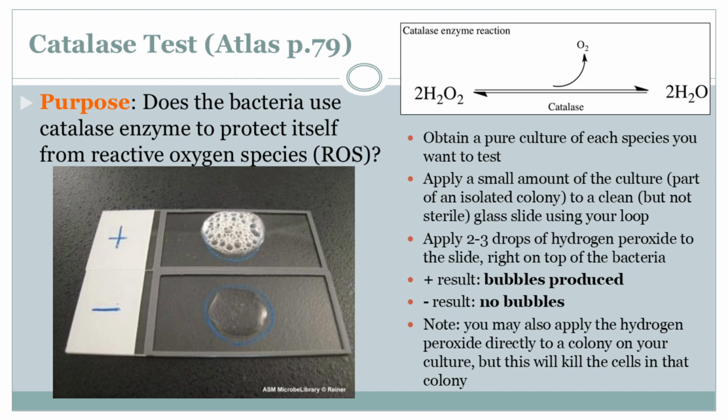Yeah. I mean, that's one of the big reasons this test is so useful. Okay, I'm intrigued. Walk me through it. How do those bubbles translate into a diagnosis? So if a doctor takes a sample, adds the hydrogen peroxide, and it bubbles up, they know it's one of those oxygen-loving bacteria. Right. Like our catalase-test.pdf source talks about Staphylococcus aureus, the bacteria behind staph infections. Staph infections, those are nasty. So those bacteria are bubbling away on the slide, happy as clams in an oxygen-rich environment. Exactly. They're well equipped to deal with those reactive oxygen species thanks to their trusty catalase.